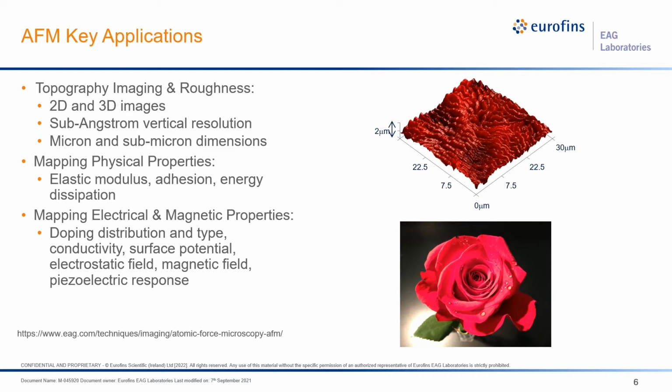So why is roughness important? The first thing that comes to mind is purely cosmetic. Topography can dictate whether a surface is visually and tactilely appealing, which is critical for many commercial products. Surface topography can influence the functionality and performance of a material too. It can reveal inhomogeneities in films. It can affect how well bone can grow into dental implants. And topography can even affect how a surface responds to water. For example, water beading up on a flower petal, which happens partially because of its microstructure imparting superhydrophobic properties.